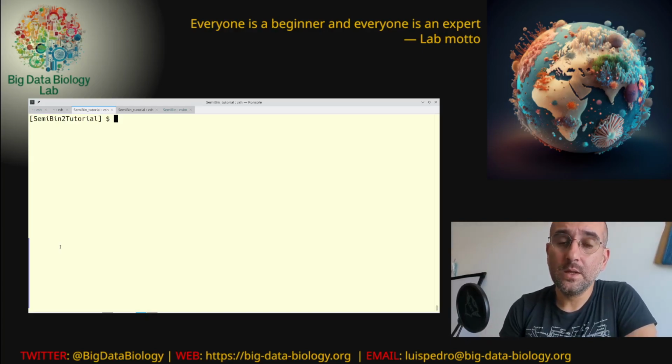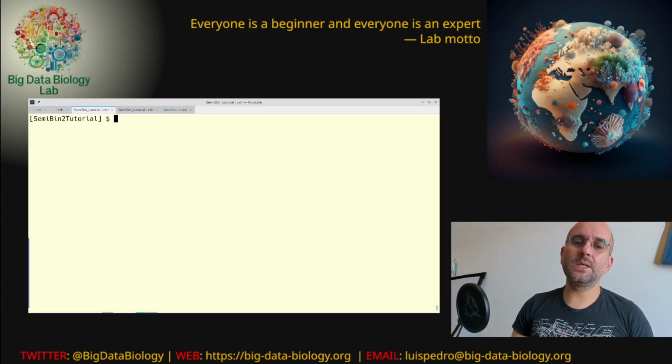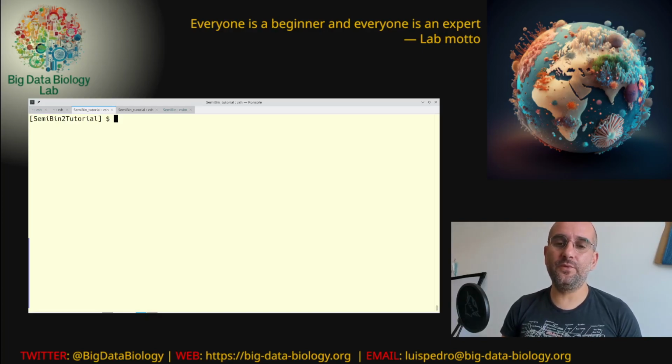Welcome back. So what we're doing today is we're running through a SemiBin2 tutorial. This is not the first SemiBin tutorial we have on the channel, but I think the other ones are now a little bit out of date because we've released SemiBin2, and even though almost nothing has changed, a few things have. So just to be sure that people are not afraid to use SemiBin2 because the other tutorial was slightly out of date, we're recording an updated version.